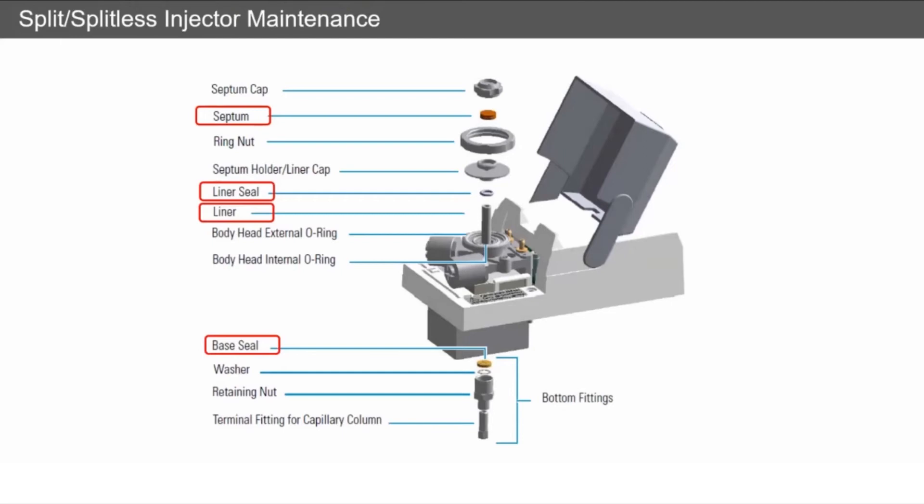So again, make sure that these are being replaced, and the base seal at the very bottom of every inlet system, there is a seal. This is to seal where the liner sits, and over time this will build up matrix, high boiling point compounds, and will become active. And this will lead to loss of analytes and calibration curves.